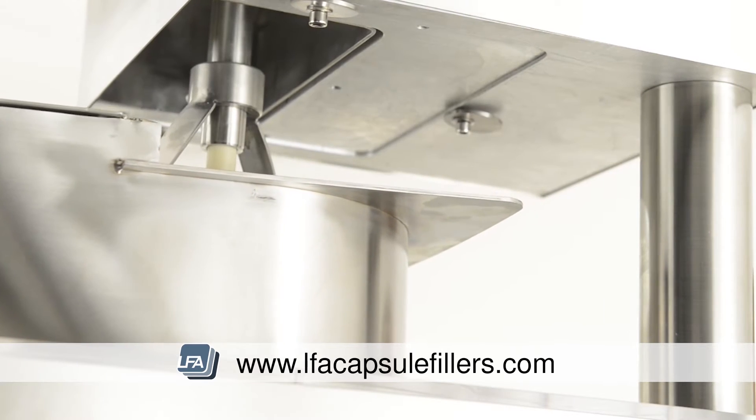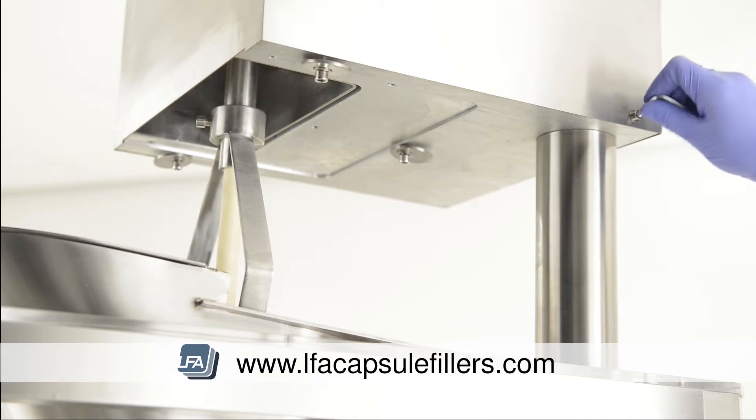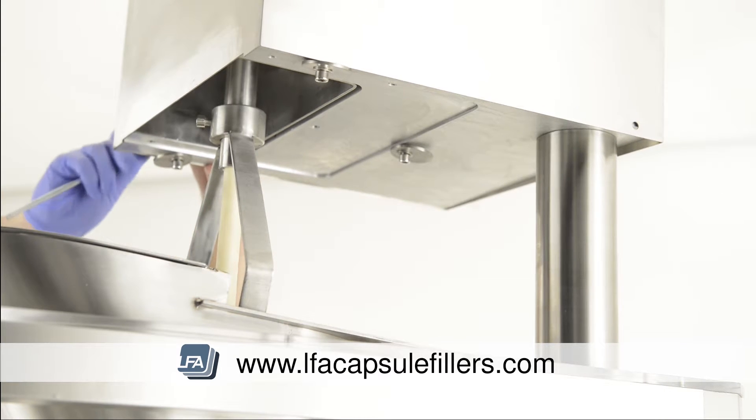We now need to remove the auger paddle so we are able to remove the hopper. To access the bolt to remove this, we need to remove the sides around the top section. Remove the two bolts at either side and then the top section should pull away.